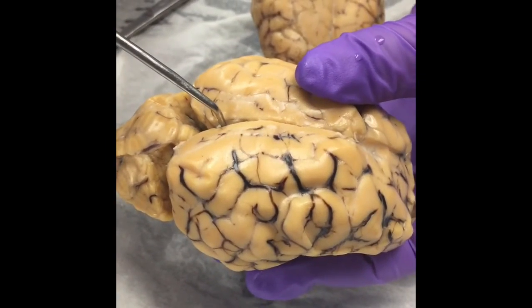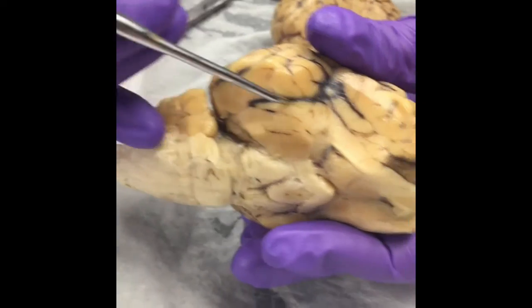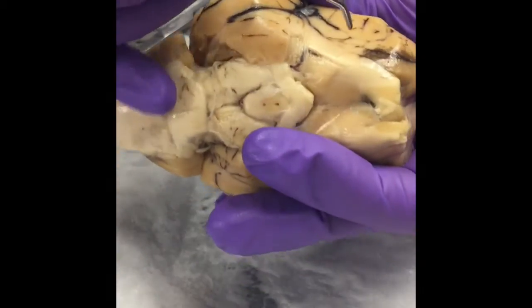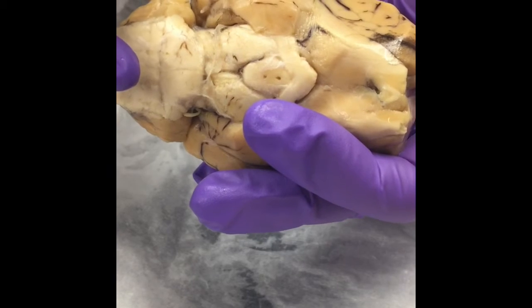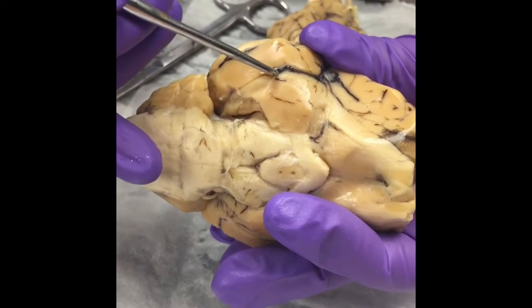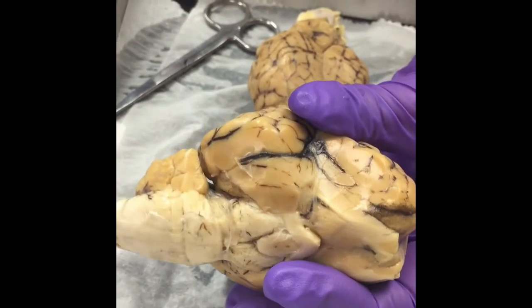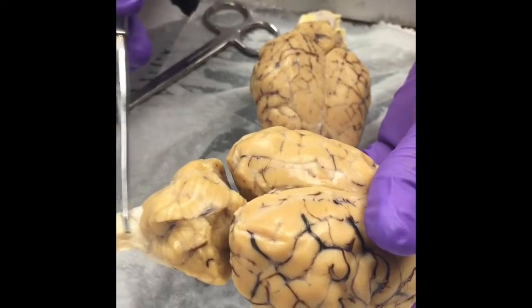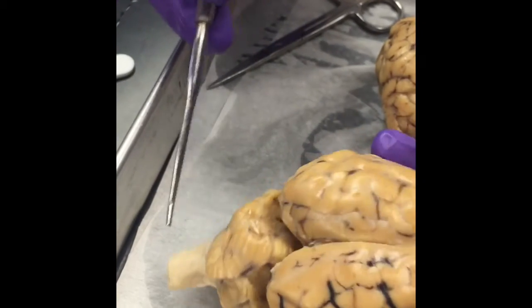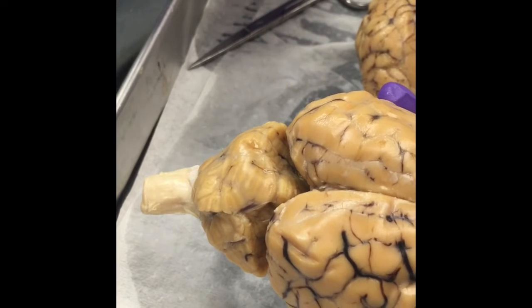Longitudinal fissure. Transverse fissure goes around the temporal lobe here. So it's that deep indentation. I don't want to rip it apart, but this indentation would go all the way around the temporal lobe like that. Okay. This piece that you see sticking out the back, that's the extension to the spinal cord. So that's where the spinal cord comes in.